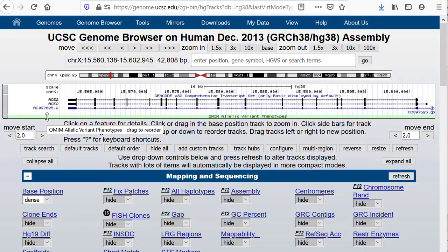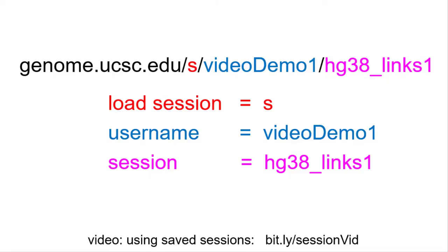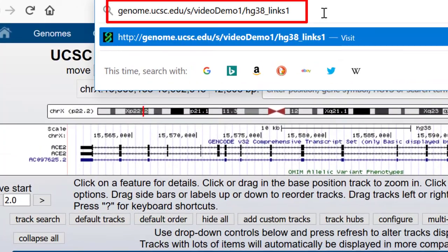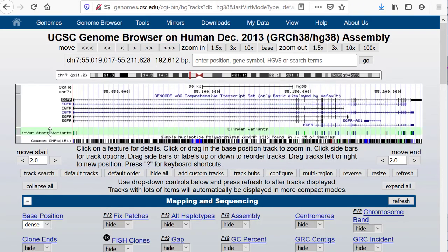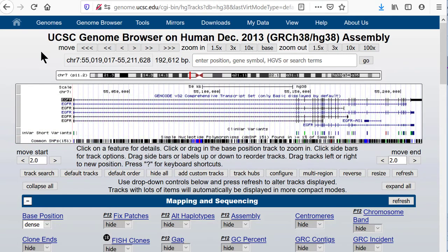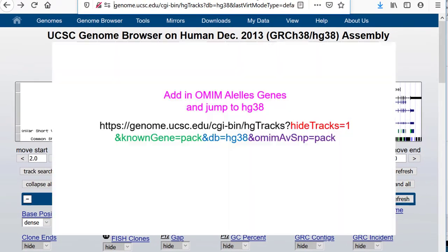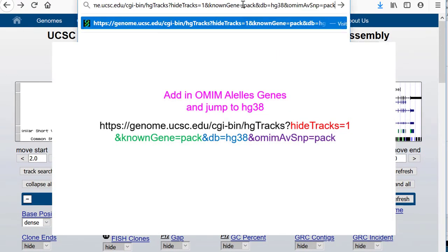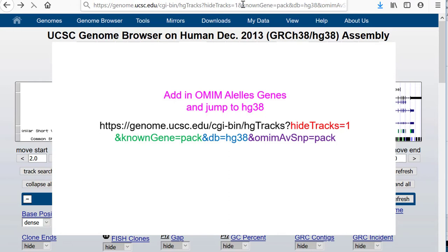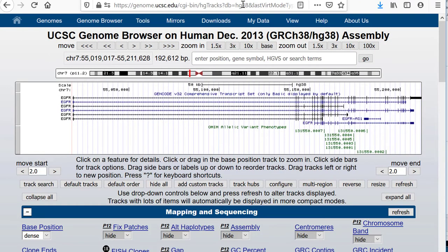Anyone clicking such a link would have those tracks turned on at whatever location they were using last time they had the browser open. To demonstrate, let's go to the saved session genome.ucsc.edu/s/videodemo1/hg38_links1. You can see the common SNPs and ClinVar tracks turned on — we're now at the EGFR gene as was saved in that session. Now let's reload the link that turns on the OMIM Alleles. It has hg38 and hideTracks=1, knownGene equals pack, and omimAvSnp equals pack. SNPs and ClinVar are now off because of the hideTracks parameter. Only the genes and OMIM Alleles are on.